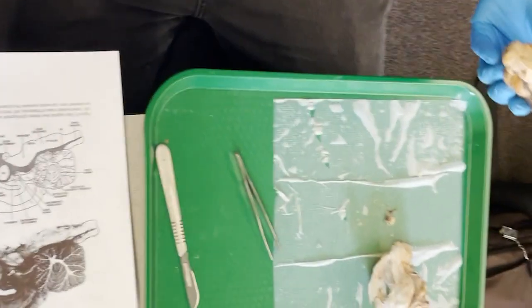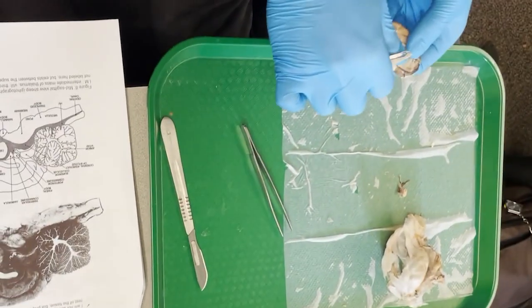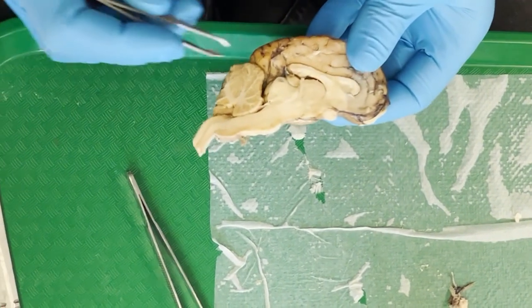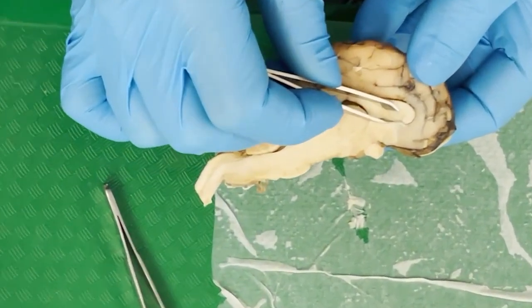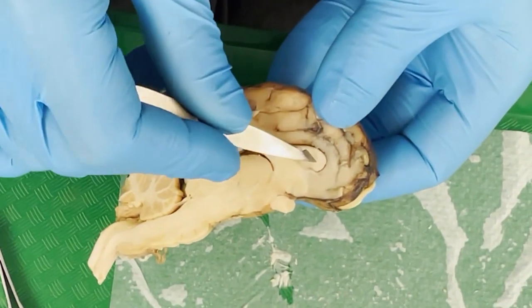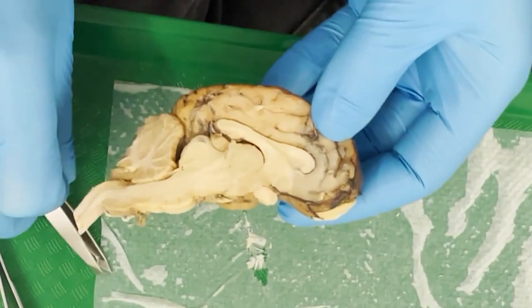The septum pellucidum intact in one of the brain preps. So people might want to come in and take a close look at this. All right. So it is located basically right here. It looks like a continuation of the corpus callosum, which I guess technically it is. But if we poke into it and pull it up, we can actually expose what is hidden inside.